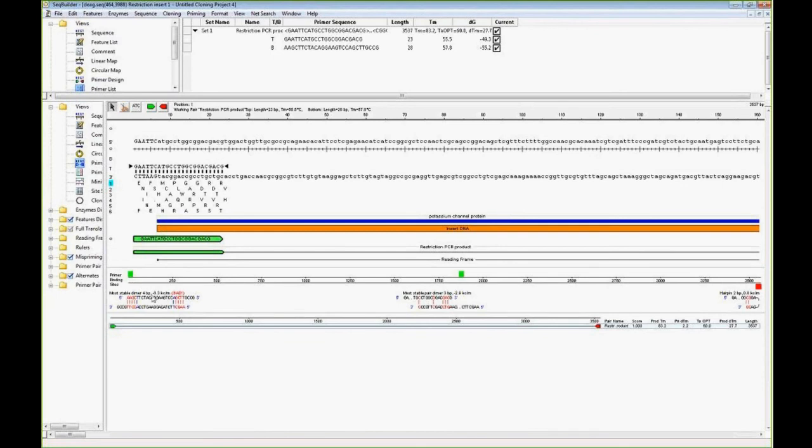So what this is showing you is the dimer formation, the stable dimer, as well as the hairpin information. These primers that we created are based on the nearest neighbor method. We try to err on the side of caution just to make you aware of things that you may need to take into consideration in regards to primer design. When we say that there's bad, what we're saying here is there's some results that you may need to think about that may affect the downstream quality of this primer for whatever reaction you're working with.